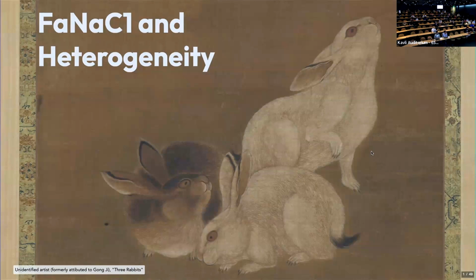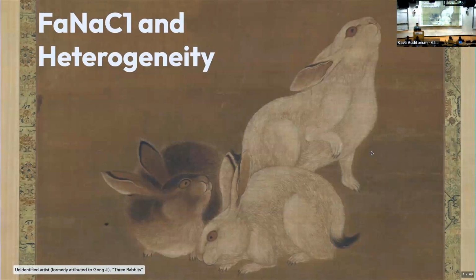But today, I think we can go ahead and get started talking about heterogeneity. This was, I think, something that basically everyone said they were interested in. And I think it's a really exciting topic because it's an area where cryo-EM really excels, because we are collecting images of these individual proteins. We have access to the information about the heterogeneity of the sample. So it's an exciting part of cryo-EM, but it is also, I think, one of the biggest challenges in processing cryo-EM data, depending on the types of heterogeneity you have.